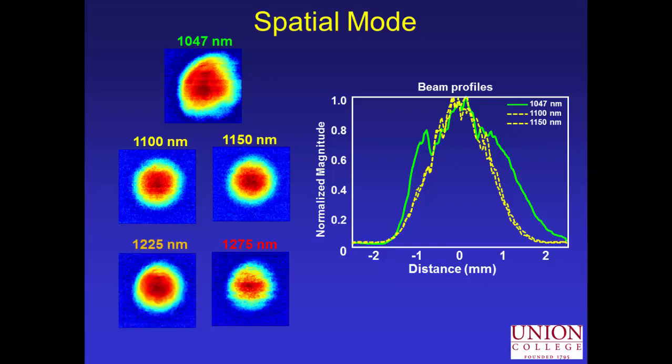And for the longer wavelengths, it's also a very nice looking beam shape. As far as the profiles, they all follow a very similar type of Gaussian shape. So indeed, the beam cleanup definitely seems to be happening, so that's good from an imaging viewpoint.